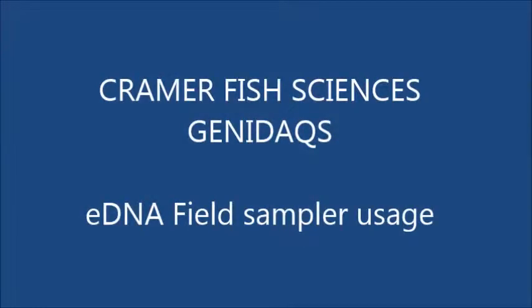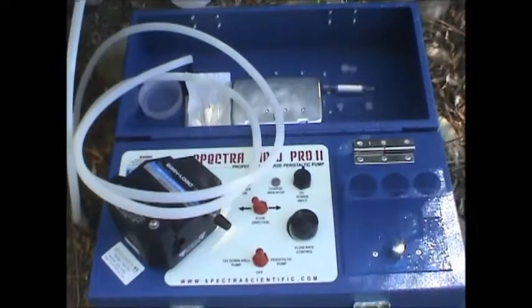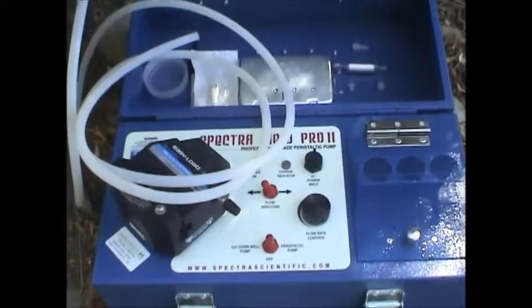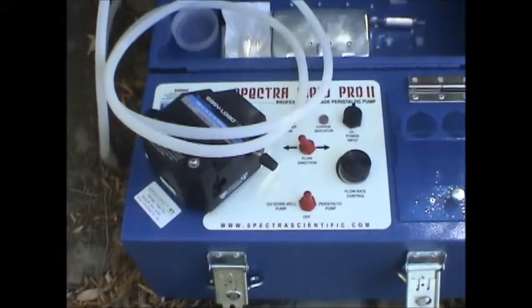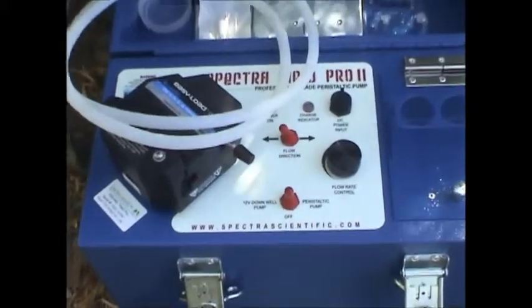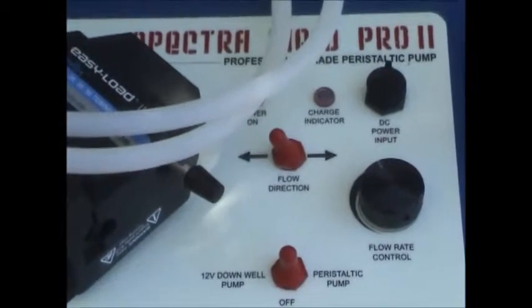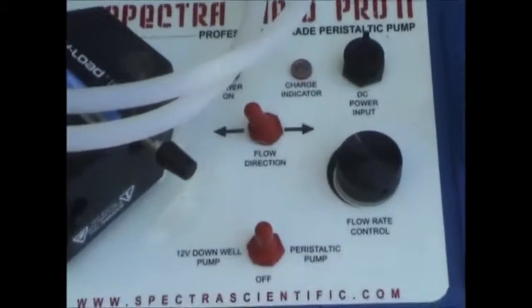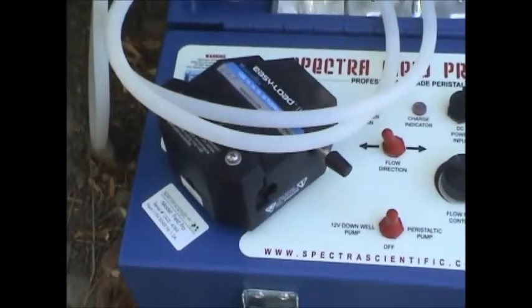Hello everyone, this is a quick video about the EDNA field sampler. Shown here is the top of the Watera Spectra Field Pro battery operated peristaltic pump. You've got two switches on top — one is a pump direction, flow direction, and the other is the on-off switch. There's also a flow rate, which is the speed that the pump head spins.